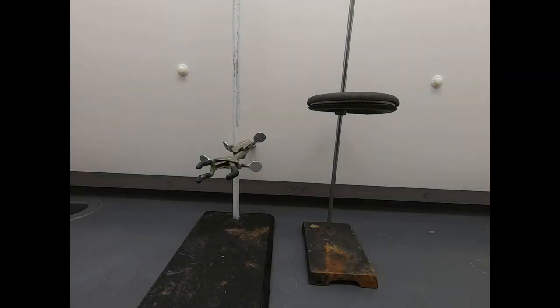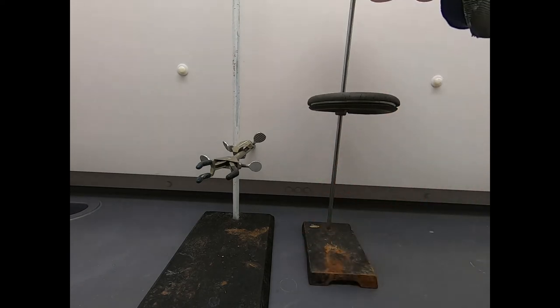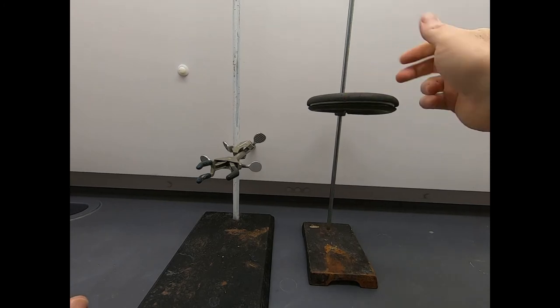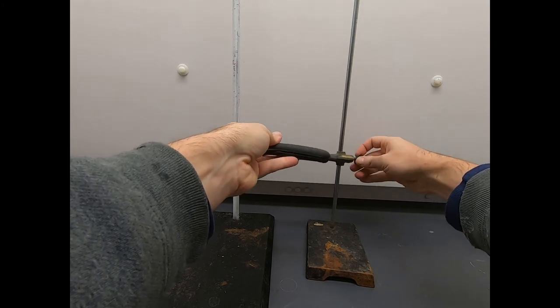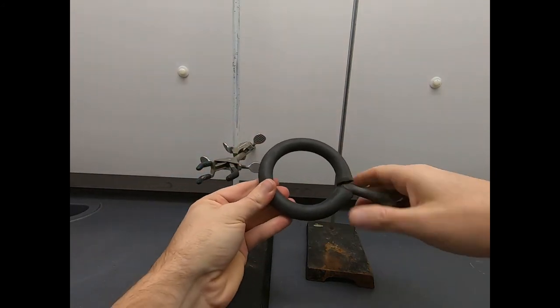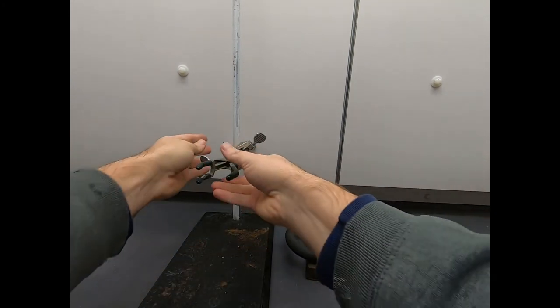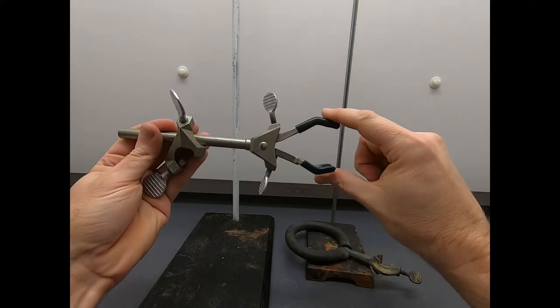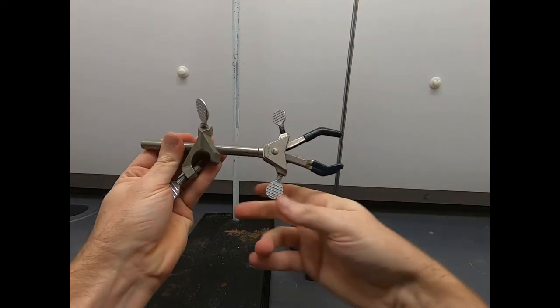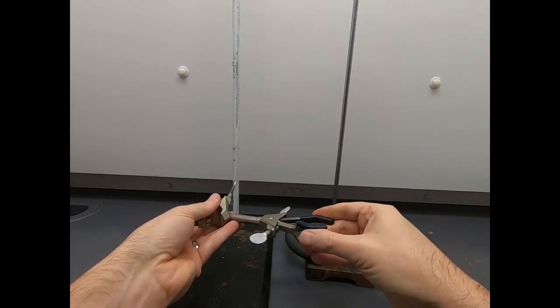These barely fit on the screen, but these are examples of stands and clamps in lab. The stand is the thing with the base and the vertical bar. And then the vertical bar gives you a way to attach accessories. Here's a ring that was given a rubber lining to make it softer, and I showed this just a moment ago as a way to hold up a separatory funnel. Here is a clamp, a three-prong clamp. This is a classic. These come in different sizes. These are made so you can grab hold of glassware and then attach everything to these posts on the stand.